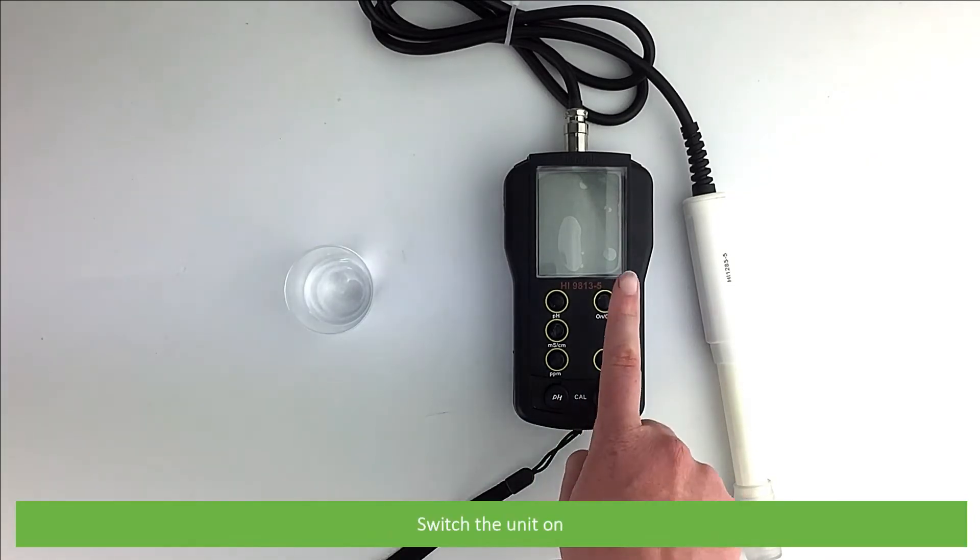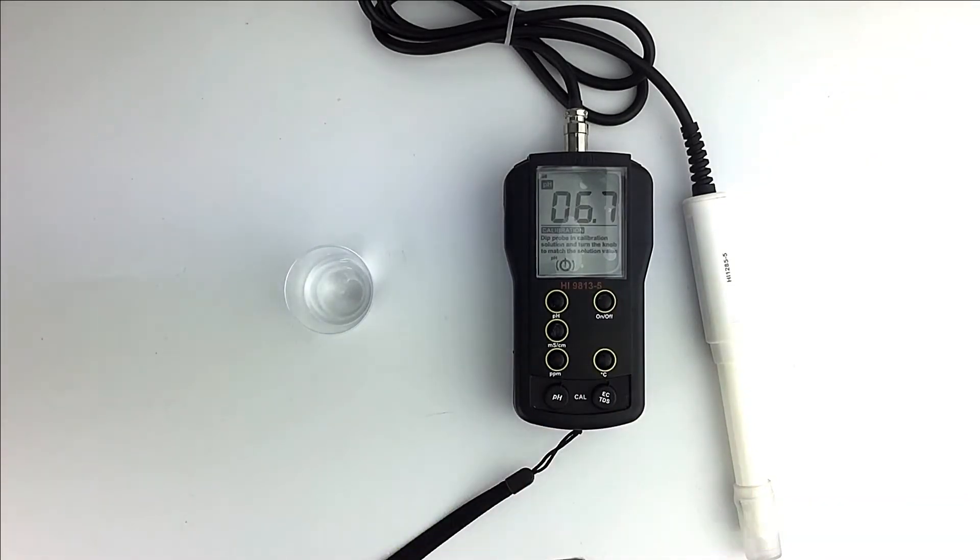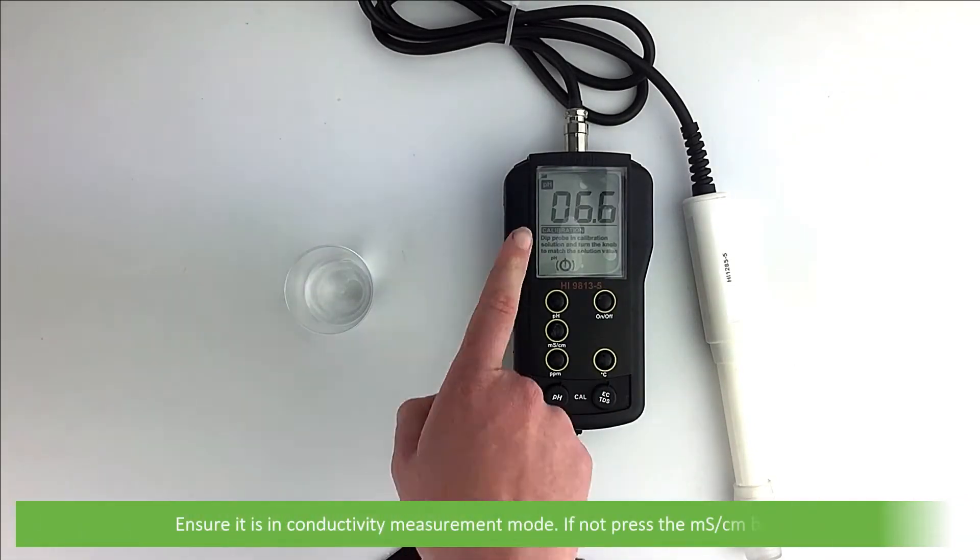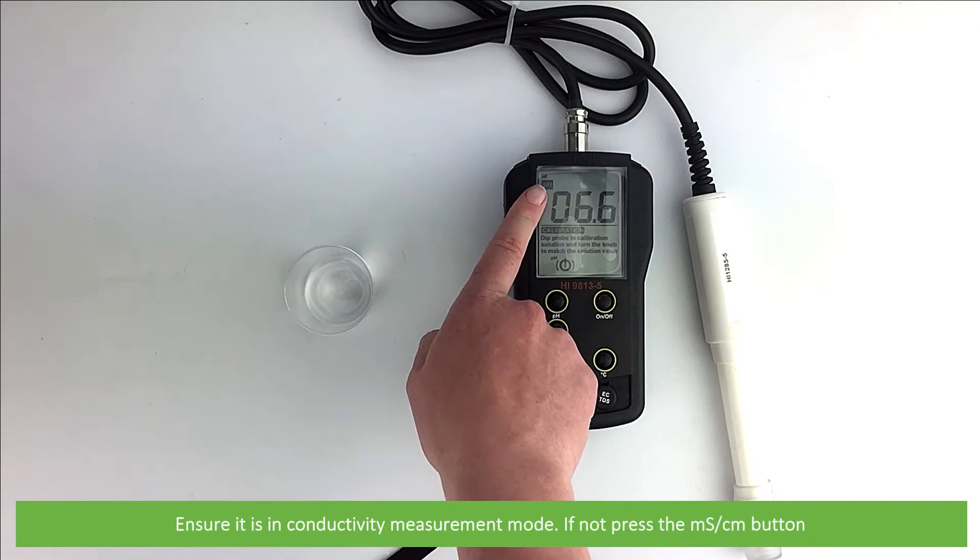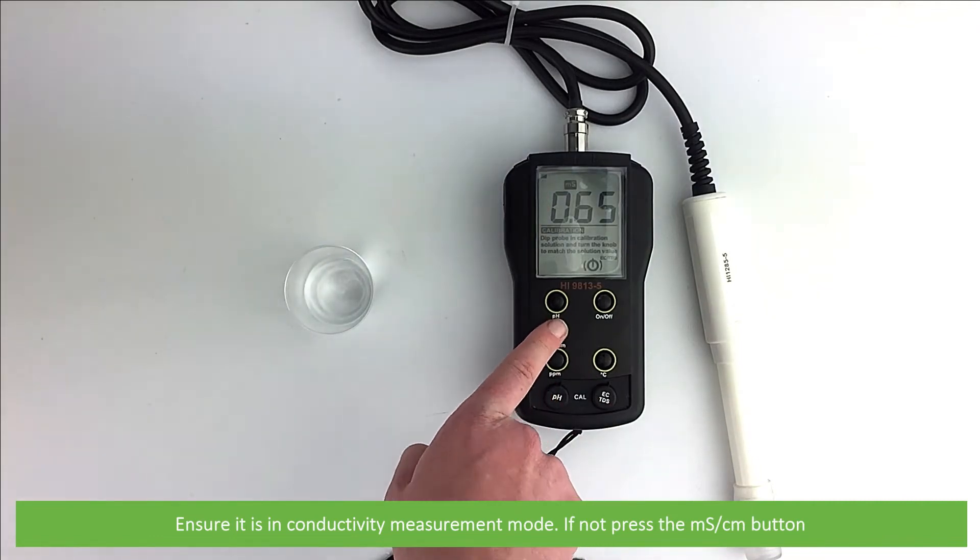To start, switch the unit on. Ensure it is in conductivity measurement mode. If not, press the microsiemens per centimeter button.